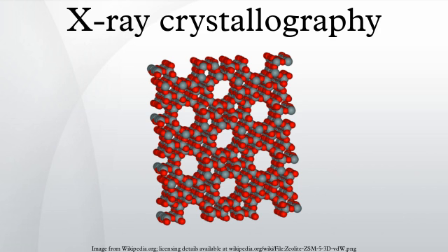Anomalous X-ray scattering. The X-ray wavelength may be scanned past an absorption edge of an atom, which changes the scattering in a known way. By recording full sets of reflections at 3 different wavelengths, one can solve for the substructure of the anomalously diffracting atoms and thence the structure of the whole molecule.